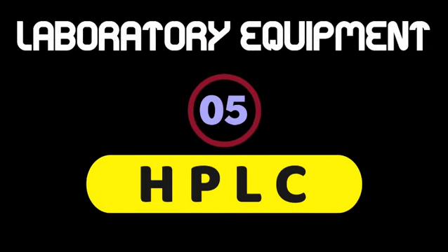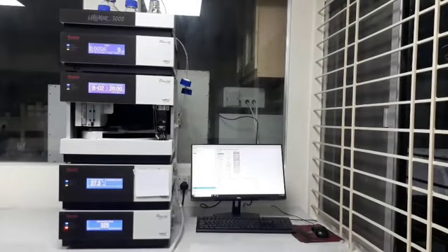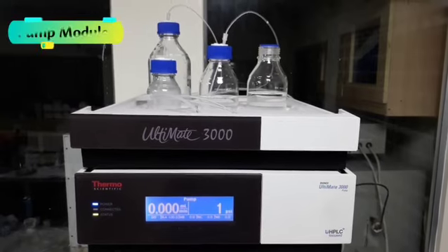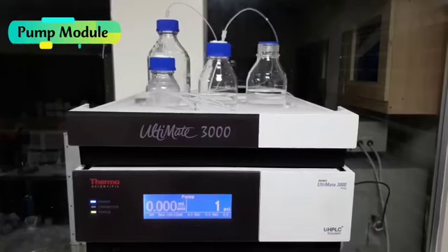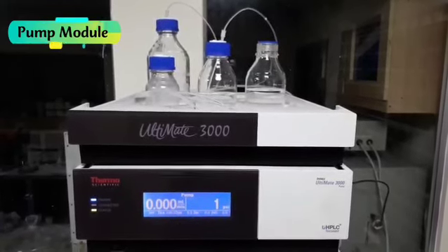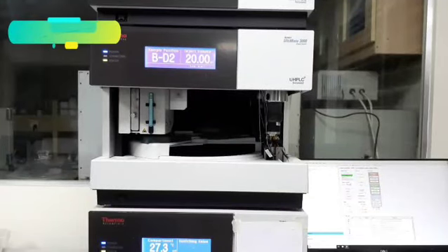Next, we are going to see the HPLC. HPLC stands for High Performance Liquid Chromatography. High performance liquid chromatography is an advanced analytical technique used to separate, identify, and quantify components in a liquid mixture. It works by passing the sample through a column packed with a stationary phase under high pressure, while a liquid mobile phase carries the analytes at different speeds based on their chemical interactions.